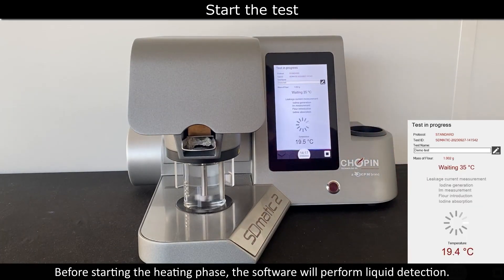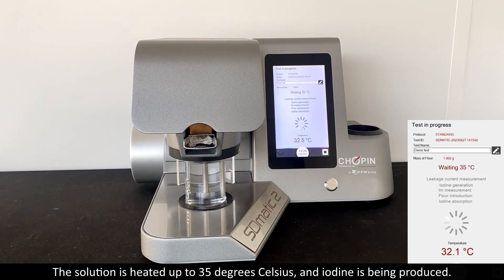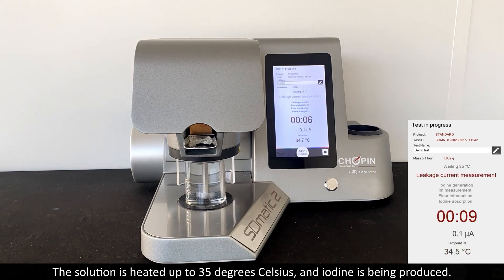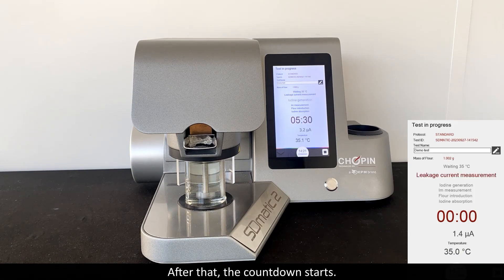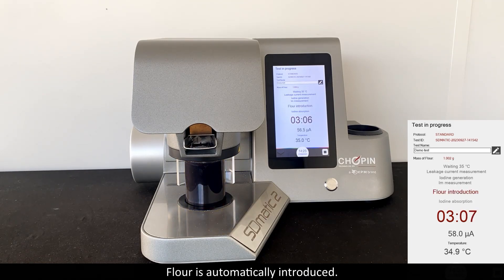Before starting the heating phase, the cell will perform the liquid detection. The solution is heated up to 35 degrees Celsius and iodine is being produced. After that, the countdown starts and flour is automatically introduced.